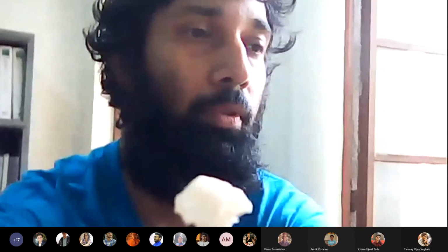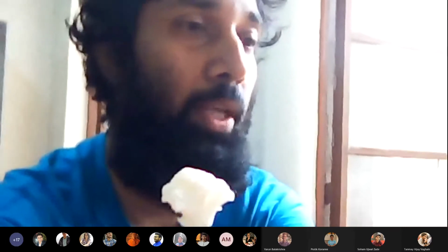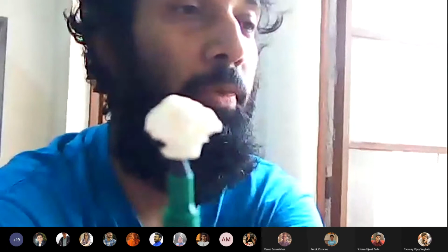So focus a bit. How does it look now? This looks different now. I'm trying to focus the camera. Slide focusing is possible in this camera. Because I see my screen much smaller than you do, I'm not able to see the focus. So how does it look? Okay, now I can actually lift it a bit.